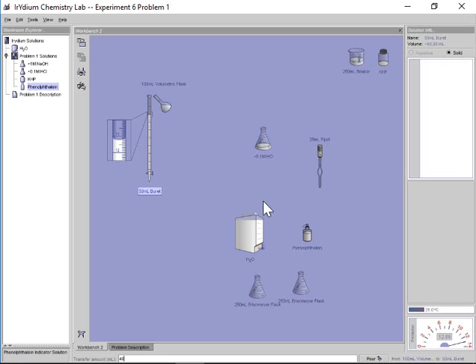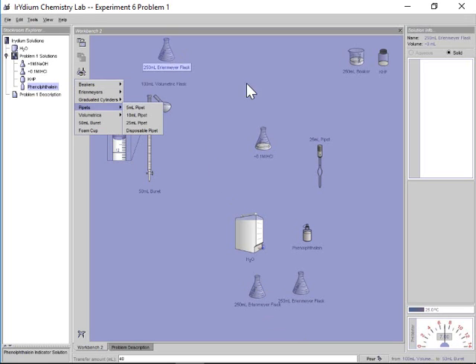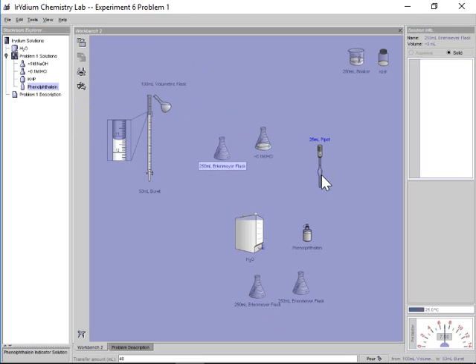I'm going to have my HCl solution. Fortunately, I have enough of that there. That's why pipetting only fractions at a time, aliquots of it, is actually a little bit helpful. I'm going to demonstrate one with a 25 ml pipette, and I'm going to do the others with 10 mils, just to show you can make a comparison between the two. So let's pull out an Erlenmeyer flask again. Let's actually pull out a couple, so we're ready. Oh, I actually have the other two left over. So I'm going to pipette. Here's my sort of more accurate trial.